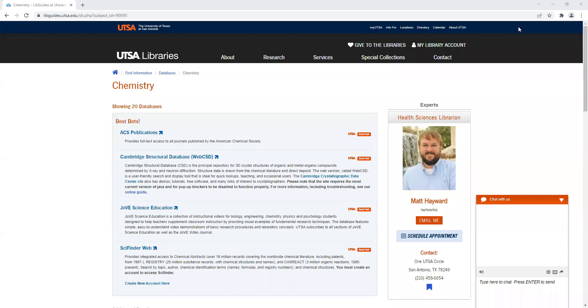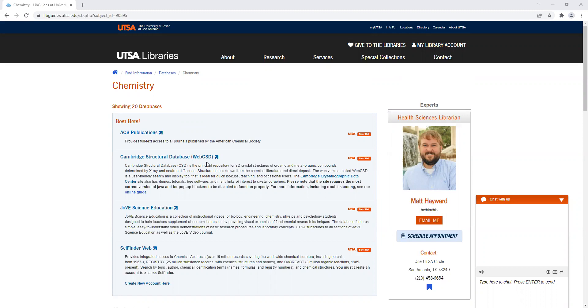The first thing you need to do is go to the myUTSA website, scroll down, click on Libraries, click on Databases, select Chemistry, and it's the second database on the chemistry list.